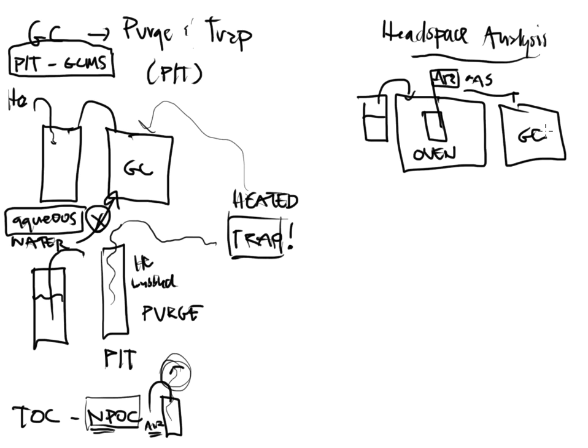So Headspace is great for the organics that are volatile, but maybe not volatile at room temperatures. Maybe they need a little bit of heat, a little bit of warmth on their feet to get them a little happy. That way they can volatilize into the vial, go into the gas form, and get sucked out of that sample and into the instrument. So that's how those two are different.